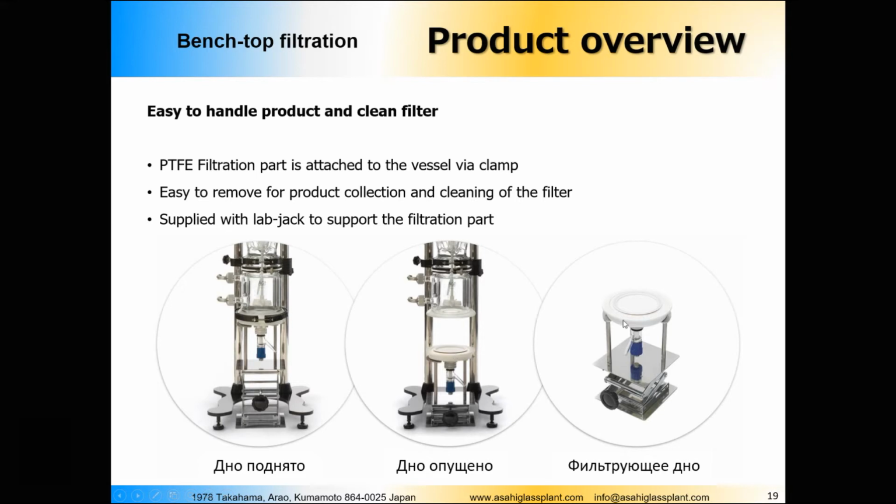When do we need that? Well, we take out the filter bottom when we have just a small amount of substance here, for example, when we do the filtration of a process which was done with a solid catalyst, and then we have a small amount of catalyst here. Or when we have a lot of slurry and a lot of sediment, then we need to take it out together with the vessel itself.